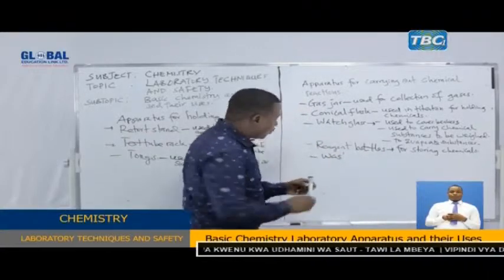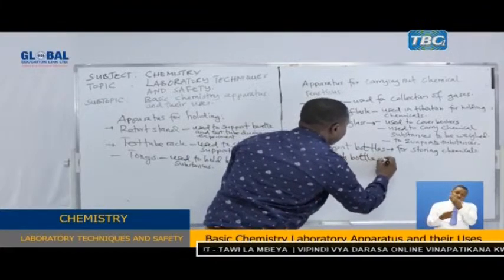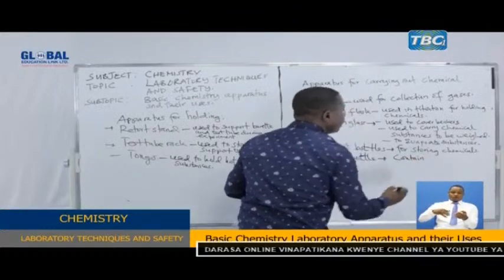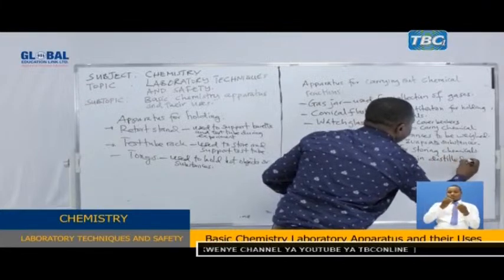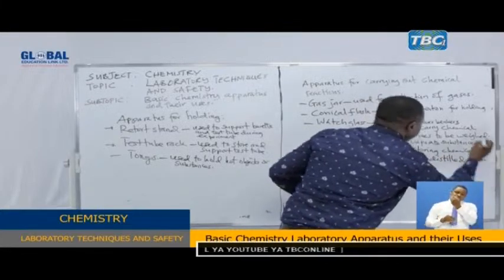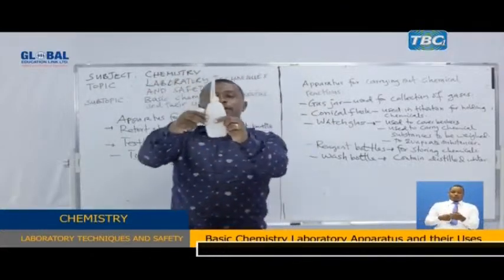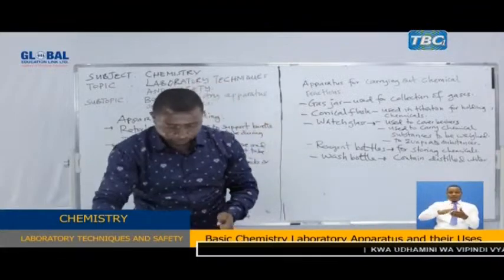We also have a wash bottle. It carries distilled water. The wash bottle is this one here. This carries distilled water that is used for chemical reactions.